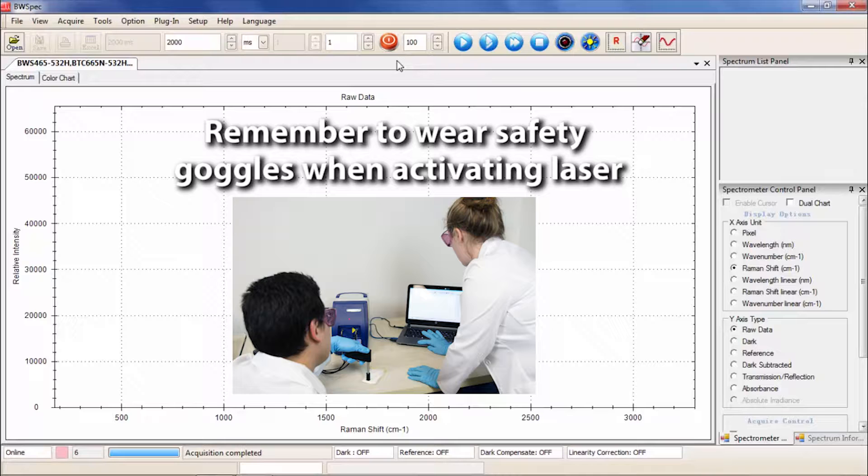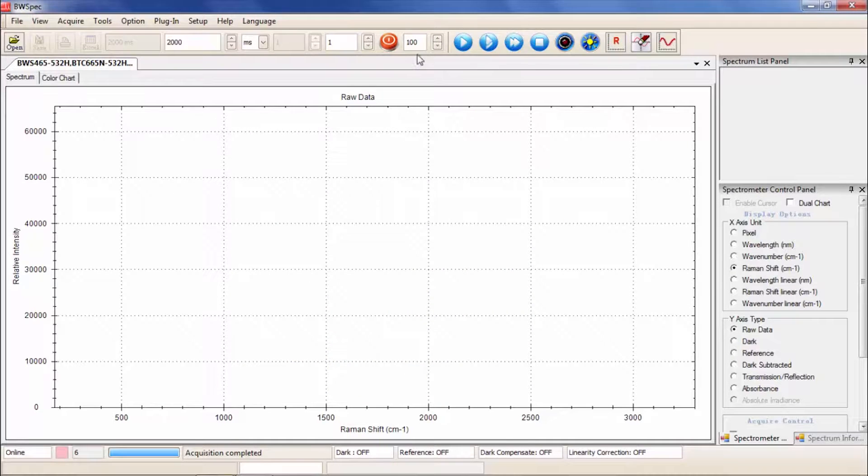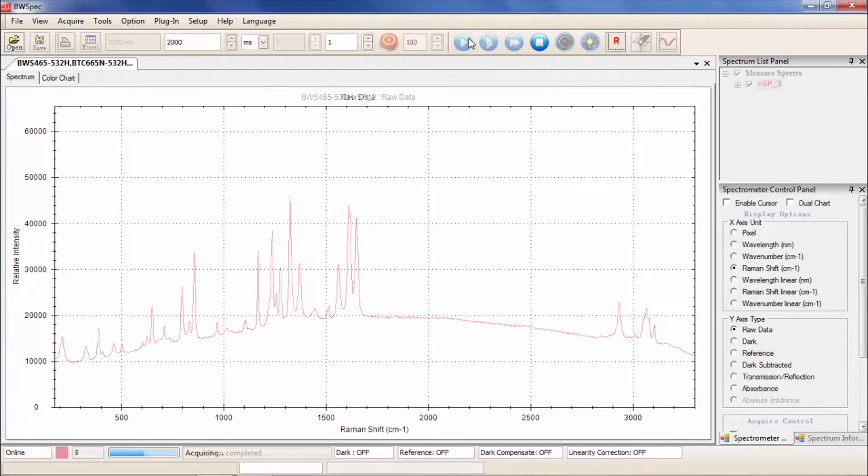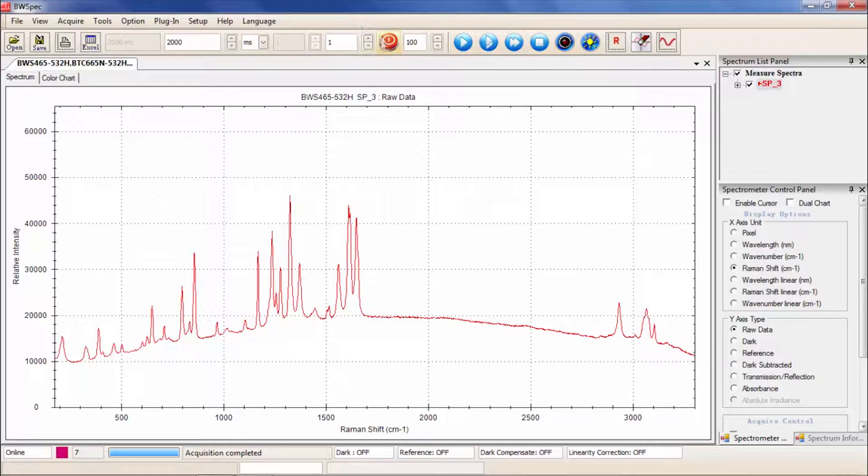Click Acquire One Spectrum. You should see peaks in your raw data spectrum. Now turn off the laser. The button will turn blue. With the probe in the same sampling position, click Acquire Dark.